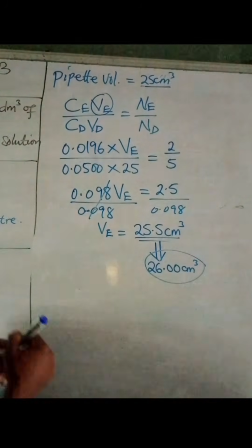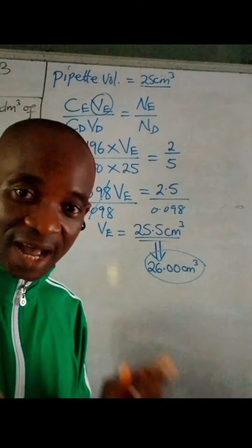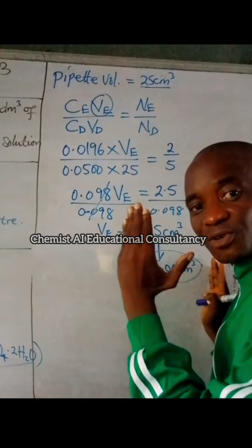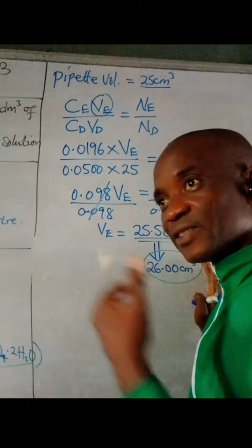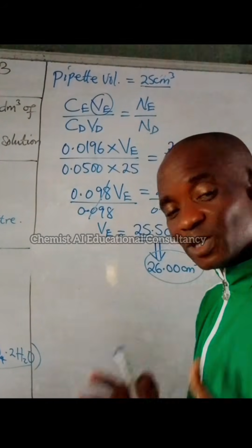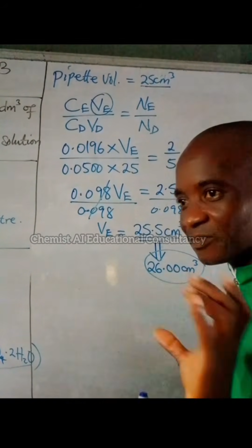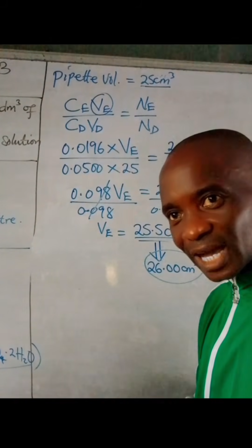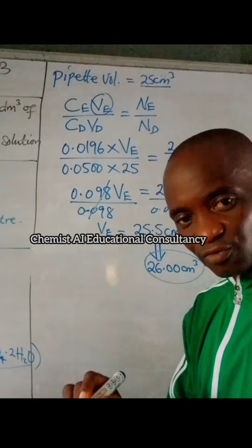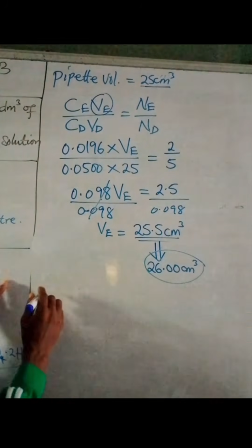cm³. And to do that, you need to make sure that all the titer values are concordant, and also that this value is also concordant with the titer value of the teacher. If you are the teacher watching this, it's assumed that you may use this, which means in building the numerous titration tables for your kids, you must make sure that their titer values are concordant with themselves, with the difference of maximum of 0.2, and also concordant with this. So to do that, we will build a titration table that looks like this.